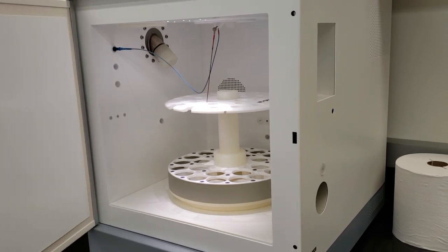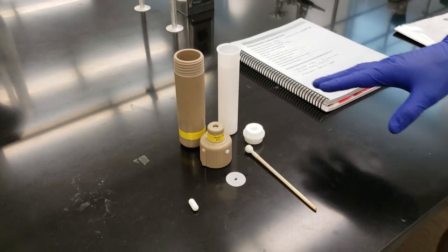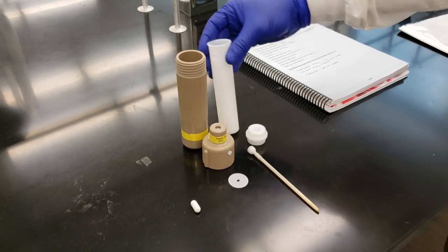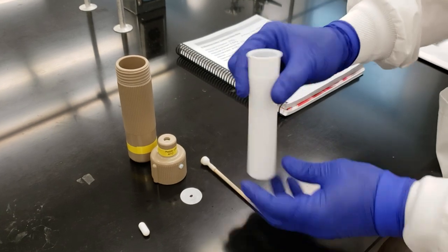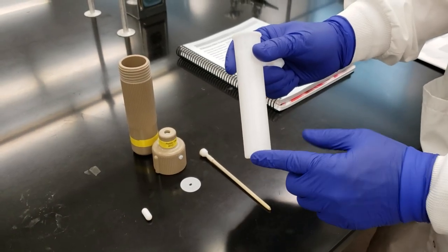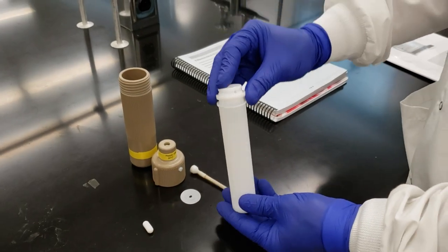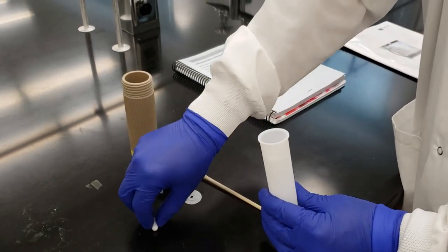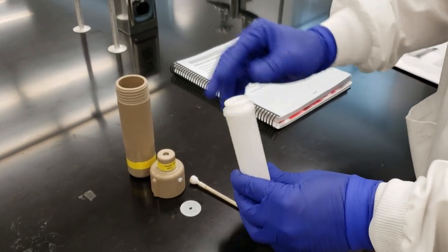Let's go take a look at our reaction vessels. The reaction vessel that we use inside of our microwave instrument is composed of two main parts. We have our inner vessel, or inner sleeve, which is composed of Teflon. Our reagents go into our Teflon inner sleeve. This is microwave transparent, meaning that the microwaves will penetrate and heat only the solution and not the vessel itself. We plug the top of this vessel using our Teflon plug here. Now, in each of our reactions, before we do that, we would place a stir bar so that we can stir the solution as it's heating.